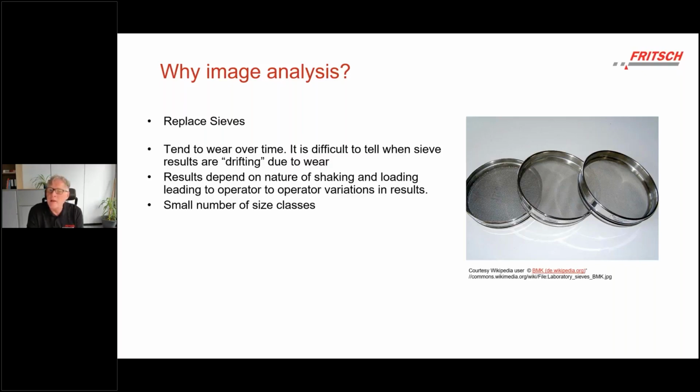Everybody who is using sieves realizes that lots of particles stick in between the meshes of the sieve. These are sometimes very tiny wires, and in the small holes formed between those wires, the particles that just don't pass the mesh stick in there, and it's not very easy to get them out.